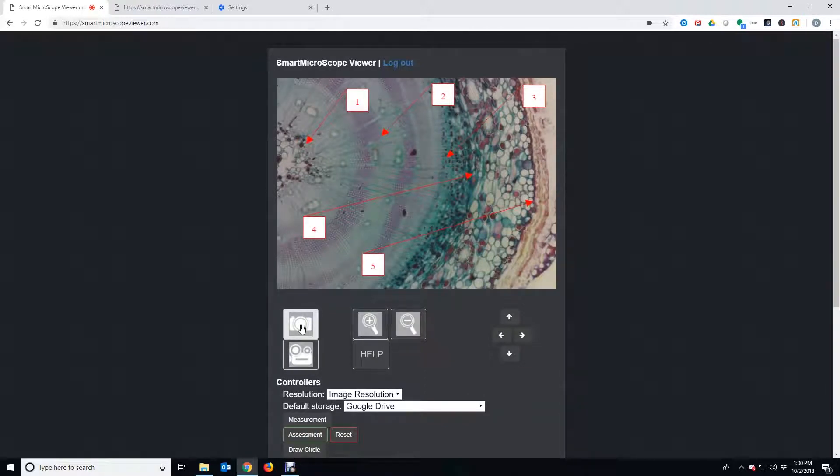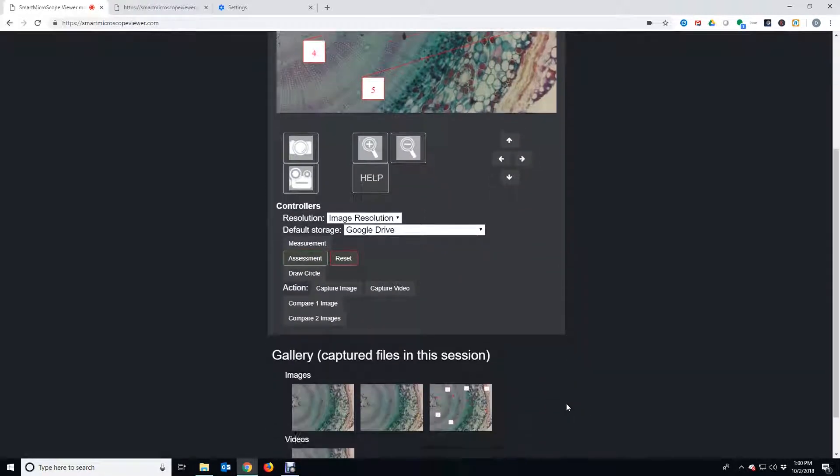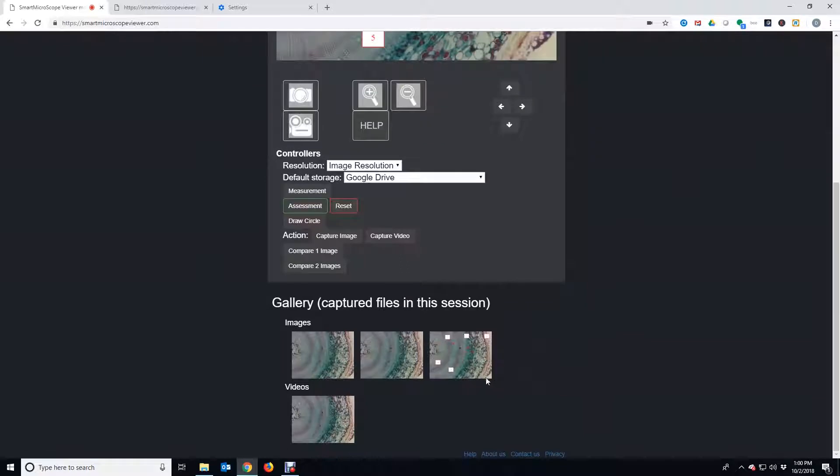The image with drawings can be saved for later use, such as formal assessments or for students who may not have been in class that day.